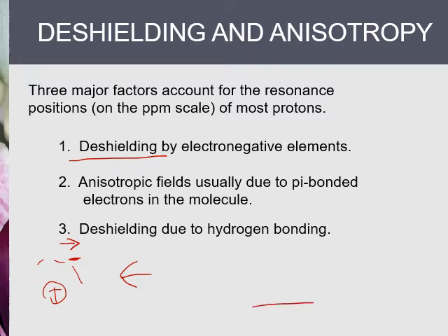On the NMR spectrum, the chemical shift needs a high field. Okay, go to the right side, the high field side. If an electronegative element such as oxygen is added to the molecule, it will take part of the electron clouds away from the nucleus, and the nucleus is deshielded, and a low field is needed for the resonance to occur.